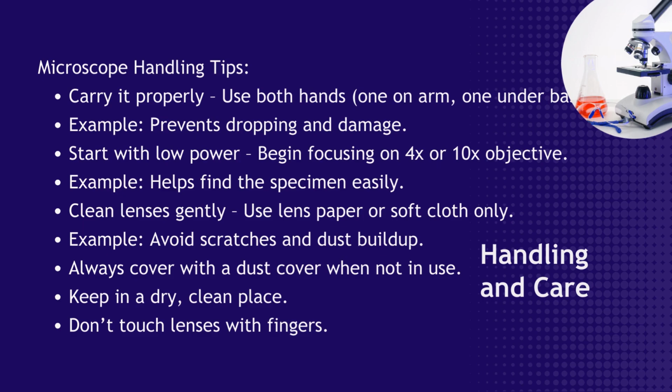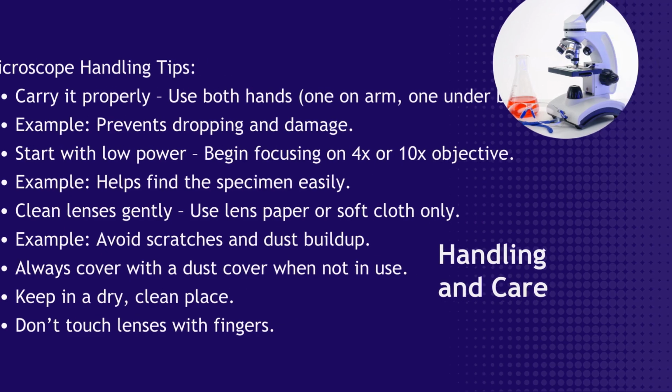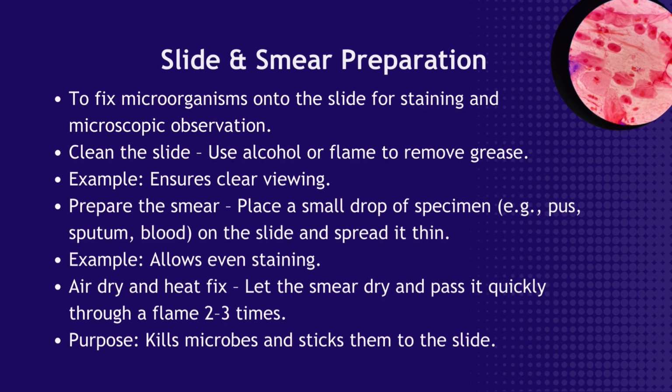Staining, slide preparation and microscopy. Slide and smear preparation: to fix microorganisms onto the slide for staining and microscopic observation. Clean the slide, use alcohol or flame to remove grease. Example, ensures clear viewing.